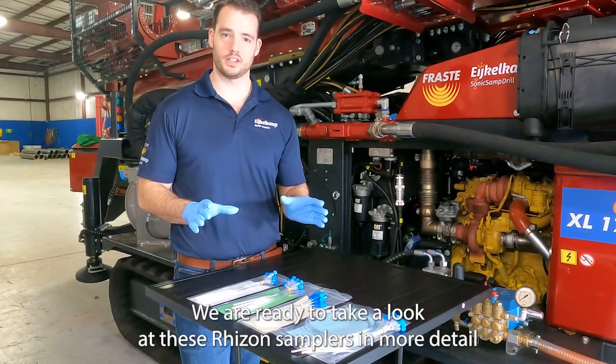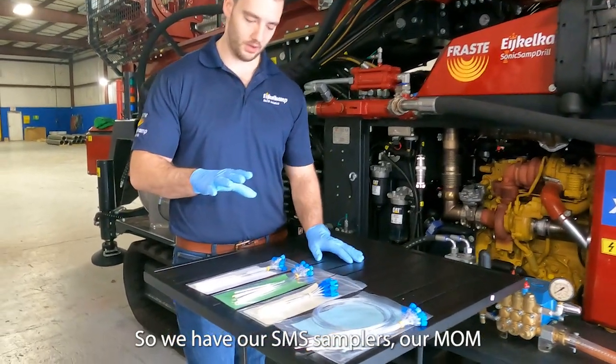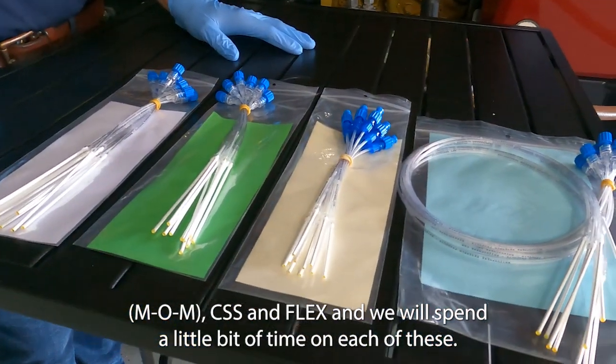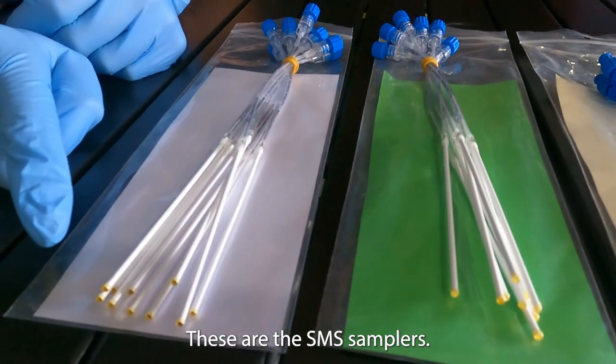We are ready to take a look at these rhizon samplers in more detail and actually get up close and personal. So we have our SMS samplers, MOM, CSS, and Flex, and we'll spend a little bit of time on each of these. So first things first, these are the SMS samplers.